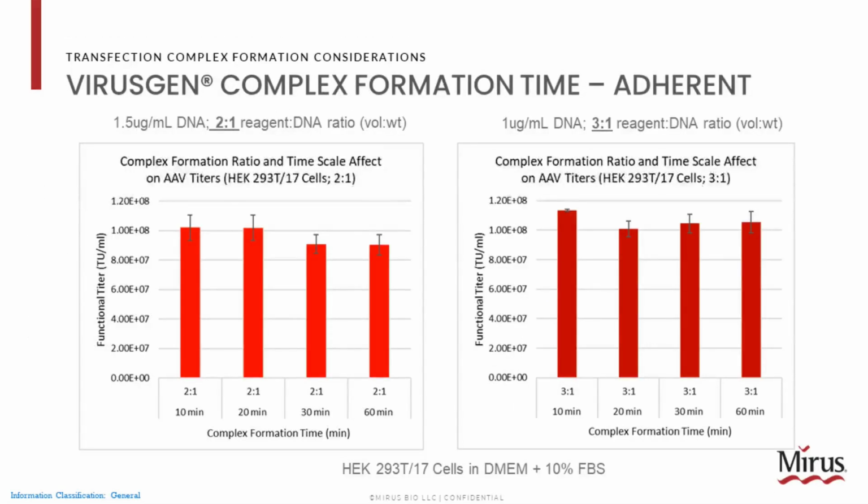And so throughout that complex formation window, the complex will be stable. It is worth noting that most processes, especially AAVs, depending on serotype and cell line, will tend to have an optimal time. Your process development group has probably determined a sweet spot. It might be 30 minutes. It might be 30 to 45 minutes. It might be closer to the smaller volume, 10 to 15. But once you're within that, you're not going to have a major risk of failure. The complex won't fall apart and will be stable throughout that time frame, giving your process a lot of flexibility and openness for your operators to correctly perform this step.